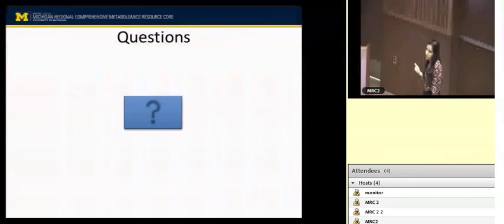Oh, so you pick one. Yes, you pick one. You won't normalize once and then apply another normalization method. You mean normalize multiple times, according to different choices? Normalize different times if it's required. Say it's tissue data, and we get different weights of the tissues when the samples are submitted. You have to decide if you want to normalize by weight or by protein. In that case, yes, you do a two-step correction: we normalize by weight and also by internal standard.